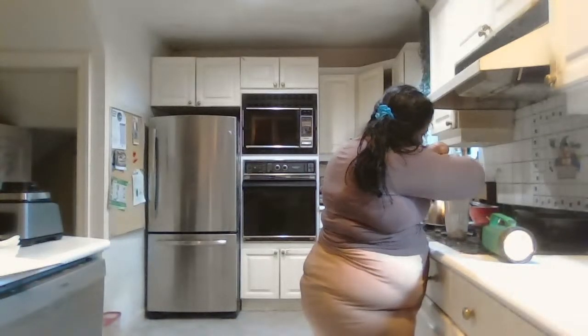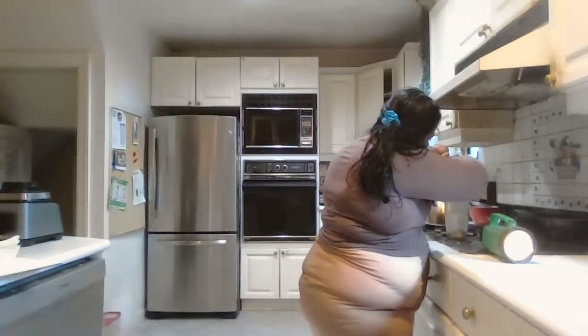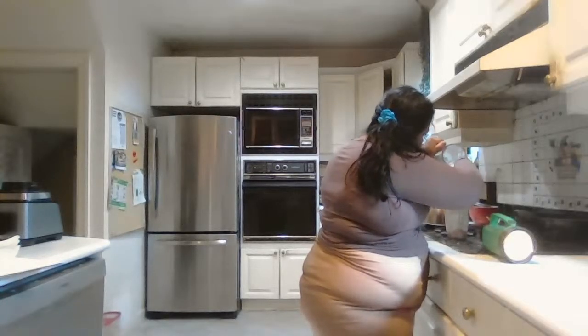So oats again. A lot of oats are going to waste. I love oats. My son's coming today. He loves oats, and so this is 40 grams. So I had to add copper first. And again, sorry, I'll have to repeat the experiment. We'll skip the calibration curve. You do it on your own.